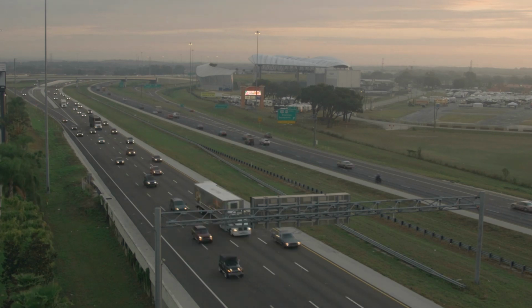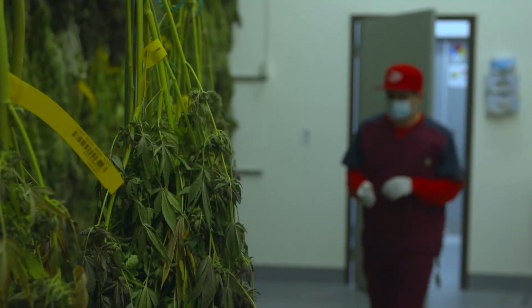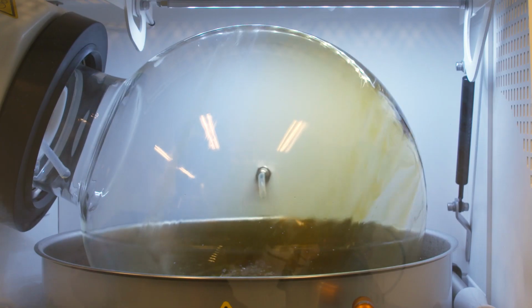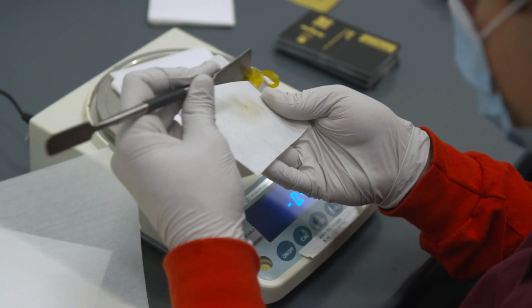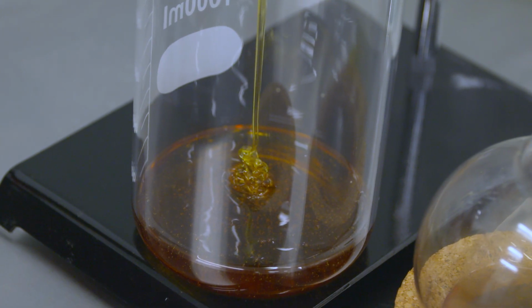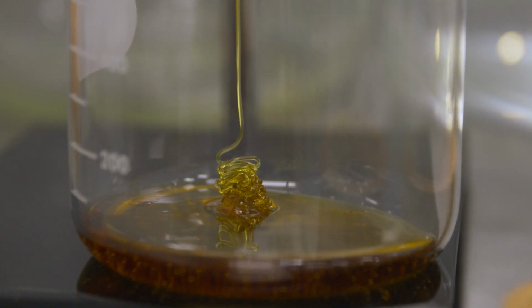Every day, the landscape of science and technology continues to evolve, bringing with it new advancements. As the legal medical cannabis scene progresses, the latest developments in machinery are being used to create the next generation of high-purity cannabis extracts. Technology is going to impact the way that cannabis medicine is being prepared in two different ways, in the way that we extract the medicine and the way that we analyze the medicine.